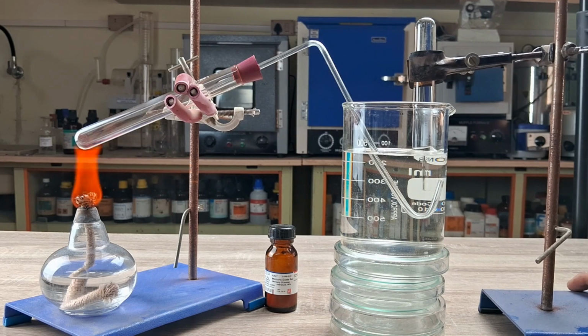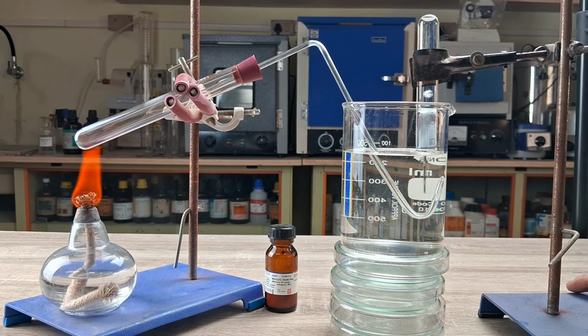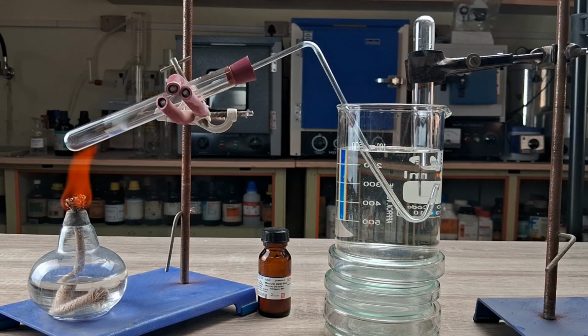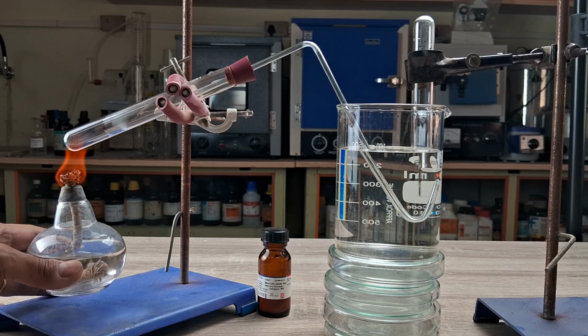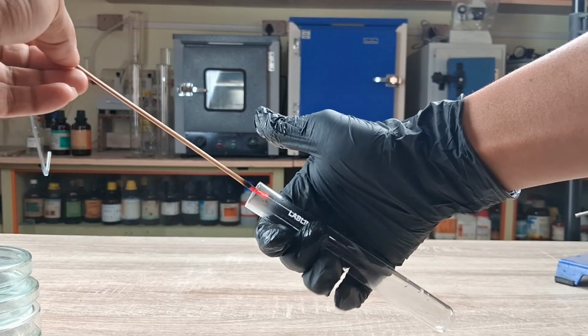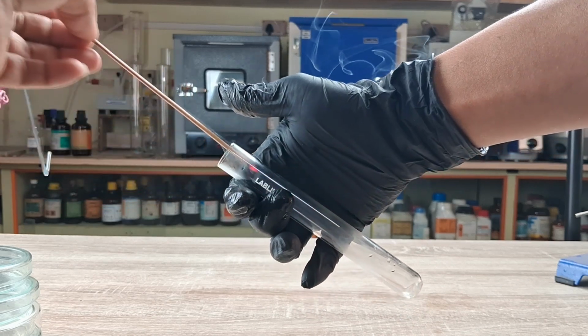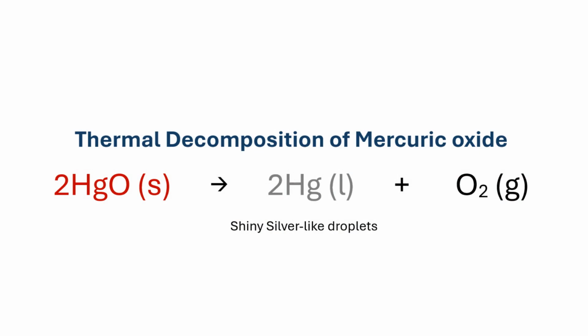The released gas can be collected in another tube by downward displacement of water. When a glowing splint is introduced into the gas-filled test tube, the glow intensifies and may even reignite with a brilliant flame, showing that the gas is indeed oxygen.